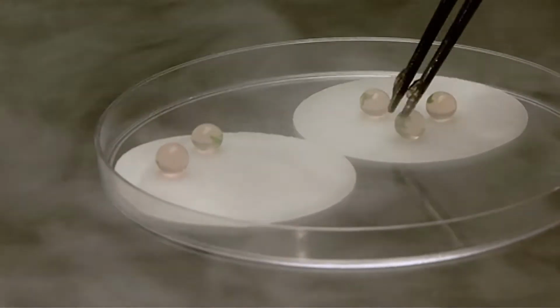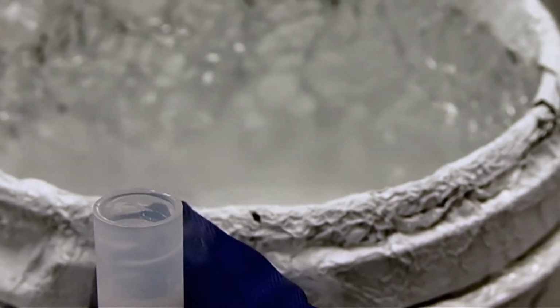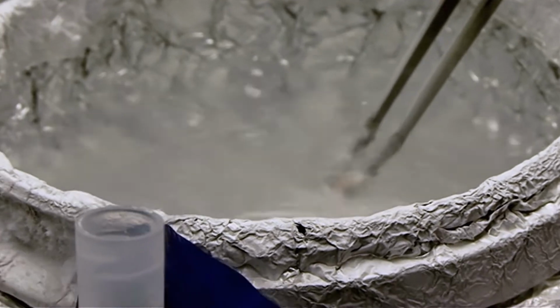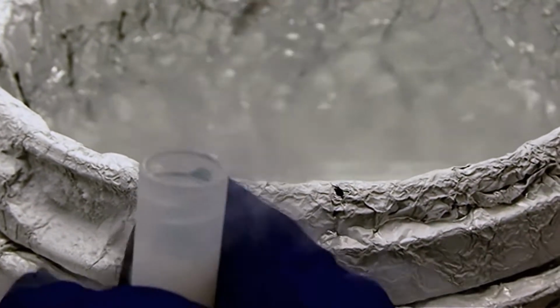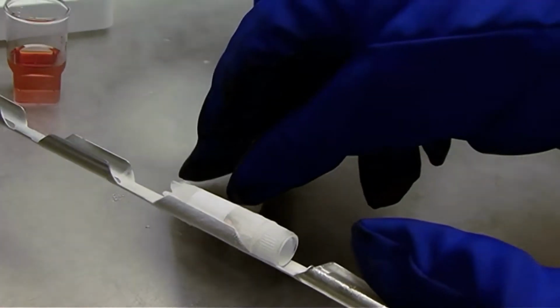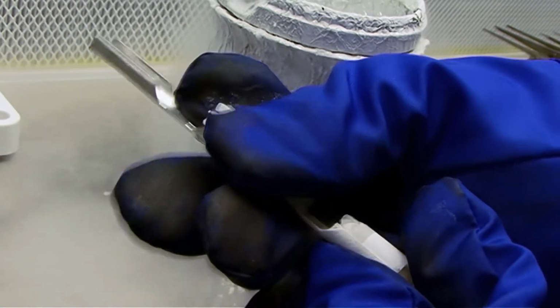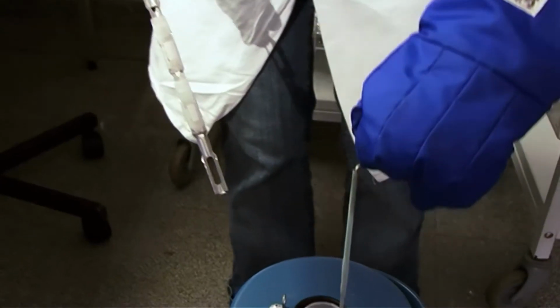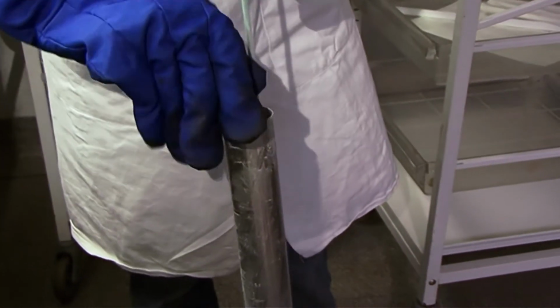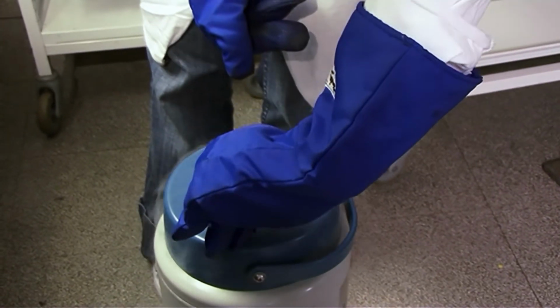Once the beads are made, the plant material with the beads will undergo a series of treatments with solutions which will prepare these beads for storing in liquid nitrogen. Once it is in liquid nitrogen, they can be stored forever. If we want to take the beads or the plant material out of liquid nitrogen, and then grow it again, we can take that material, then warm it in a water bath at around 40 degrees centigrade. And then we can put it into a medium where it will grow. And from the bead, the plant material will just pop out slowly, and that will grow and then multiply in that medium.